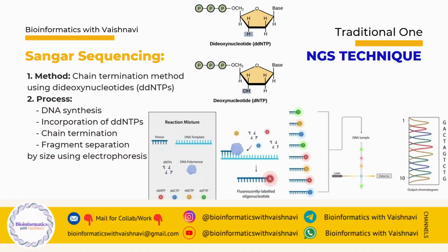See, Sanger sequencing is based on the chain termination method. It uses special nucleotides called ddNTPs, dideoxynucleotides. During DNA synthesis, when ddNTPs are incorporated, the chain stops growing. This creates DNA fragments of different lengths, which are then separated by electrophoresis to determine the DNA sequence.